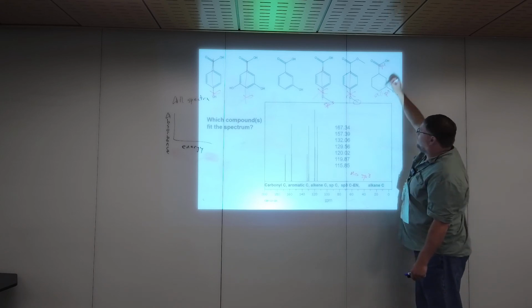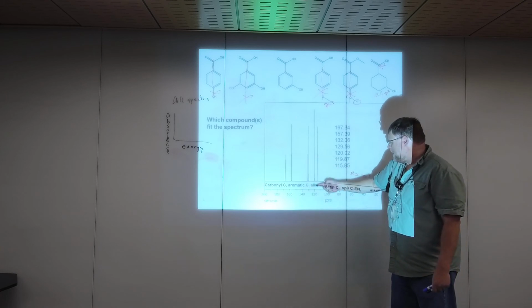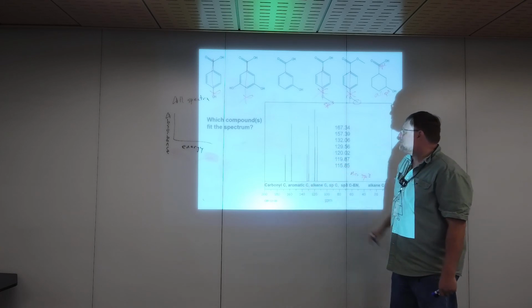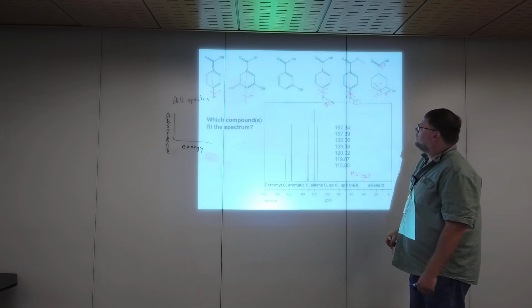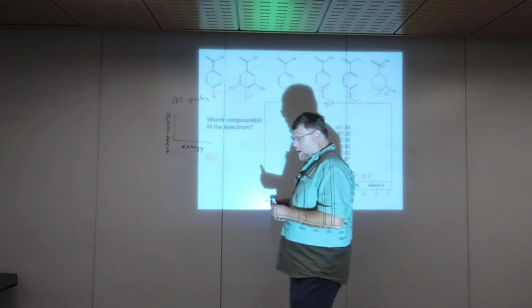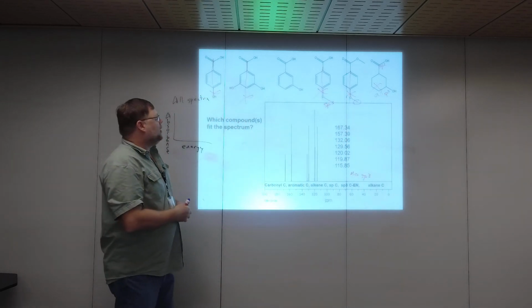There's an sp2 up there, but there's just one. These are sp2, right? Aromatic alkene, sp2 CHs, or carbons. So this one's out. There you go. That leaves one. Process of elimination is great, but don't just rely on that last one.